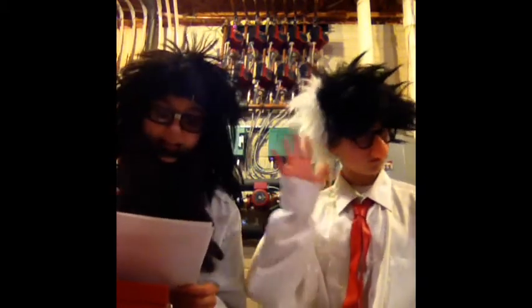The experiment had yielded results that were mostly in line with the hypothesis. The hypothesis stated that the red 40 would have the longest wavelength of max absorption at the lowest pH. However, the sample of red 40 at the second lowest pH, a pH of 5, had the longest wavelength of max absorption. So the hypothesis was very close in saying that red 40 would have the longest wavelength of max absorption at the lowest pH.